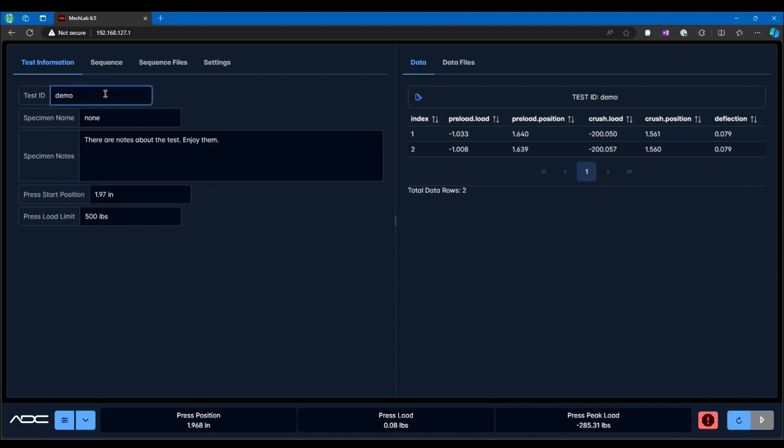Because this is used as a file name, there are limitations to the characters you can enter in this field. You can't use spaces or weird characters. You can use underscores and numbers, but you can't use something like a dollar sign or an ampersand. If you're entering a value and you want to undo it, simply press escape or click the cancel button on your field and it goes right back.